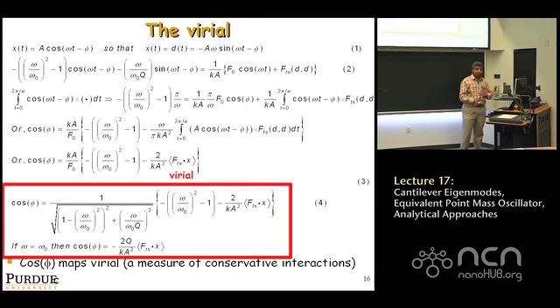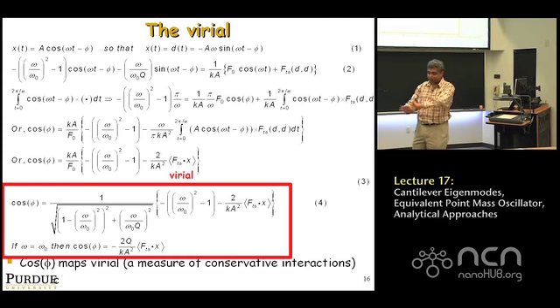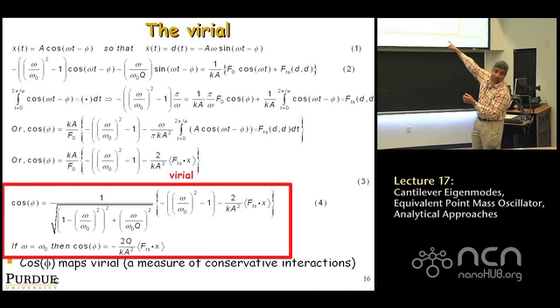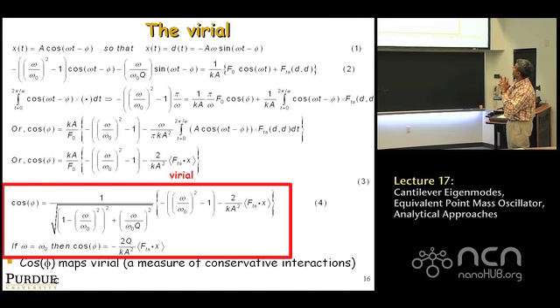So, really cool stuff. But there is another part which most people neglect. All right? Most standard AFM theory just multiplies by cosine and gets done with it. You could also take the same equations and multiply by cosine omega t minus phi. You see, the previous slide, I multiplied by sine omega t minus phi. Now I multiply by cosine omega t minus phi. Very important result also. I want to leave you with this, okay? So give me 2 minutes to wrap this up.